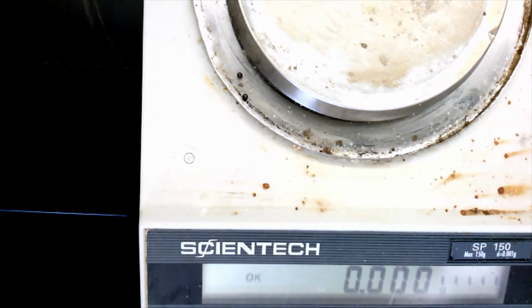So the mass actually went up even though we burned our magnesium. I kind of touched on this earlier, at least I hope it was in the take that I ended up including in this video. It makes sense because usually when we burn carbon-based fuels like paper or wood, they make a gas product. Carbon, when you burn it, turns into carbon monoxide or carbon dioxide, which is a gas. So when we think about carbon things burning, we think about them losing all their mass and just turning into smoke and just a tiny little bit of ash that's left over.